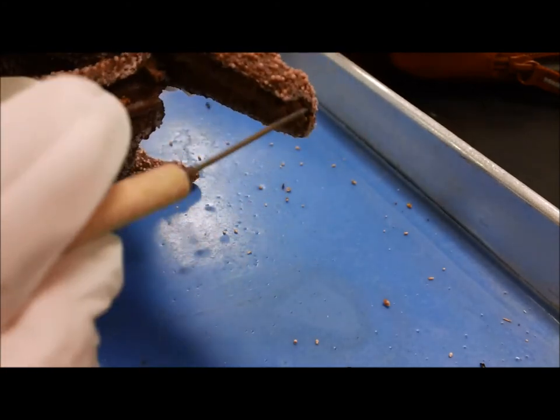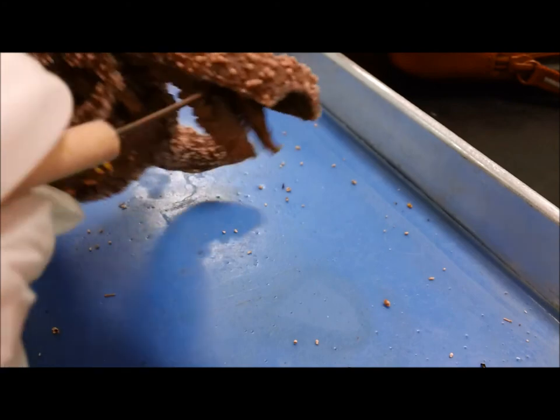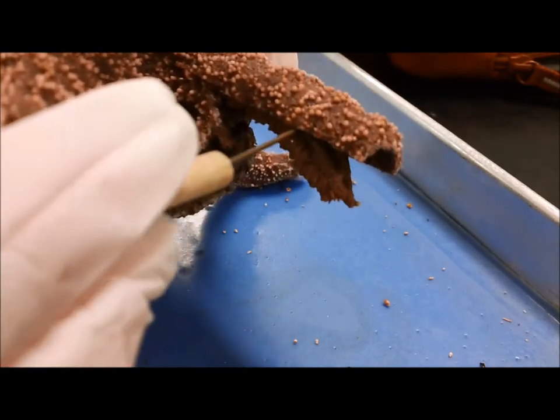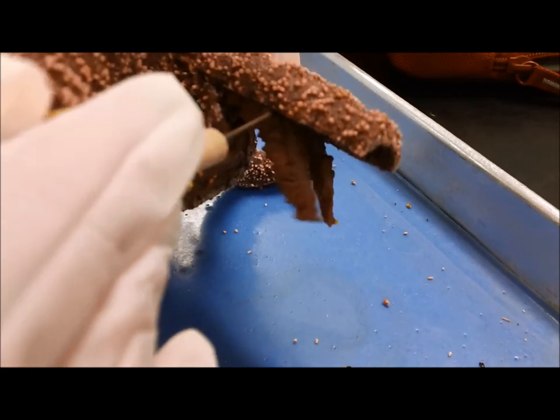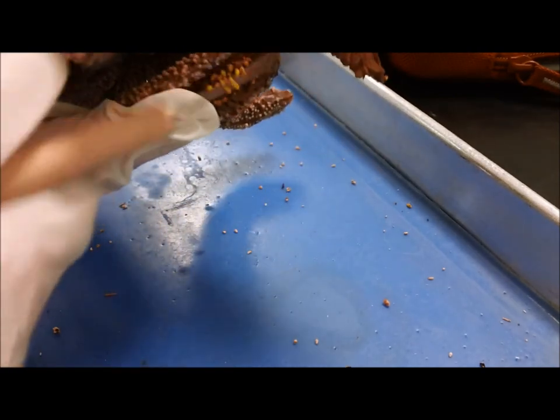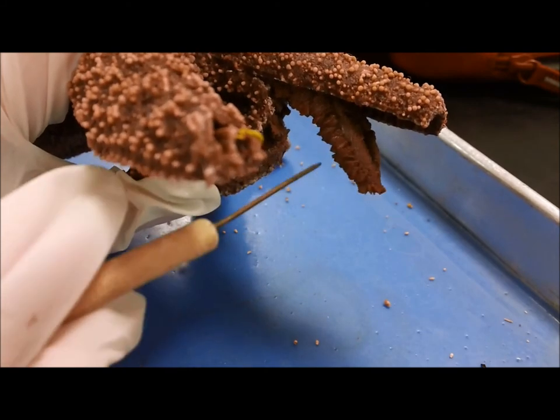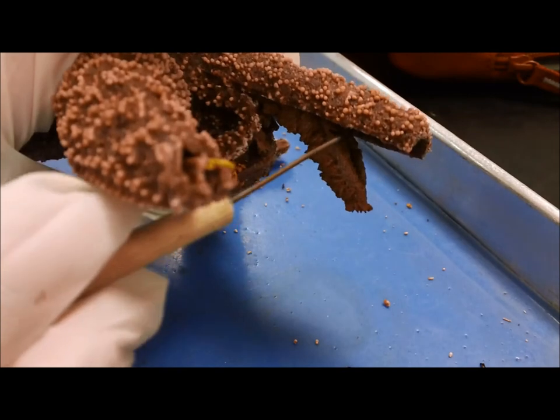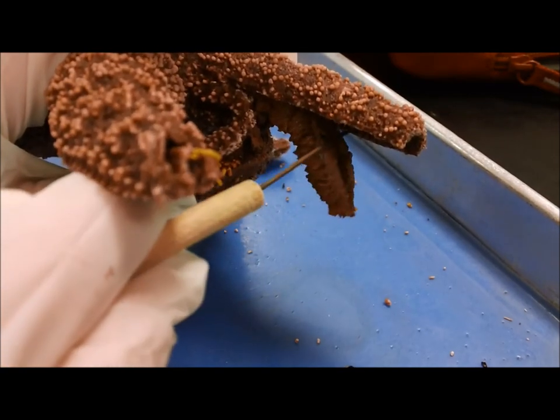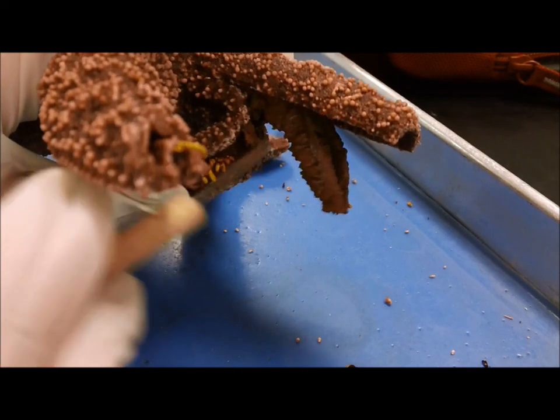So we can kind of lift those up and out so you can see them a little better. See how all the little pouches are? And if you look at the picture in your packet, you can see them even better — though of course it's actually not a picture, it's just a diagram.